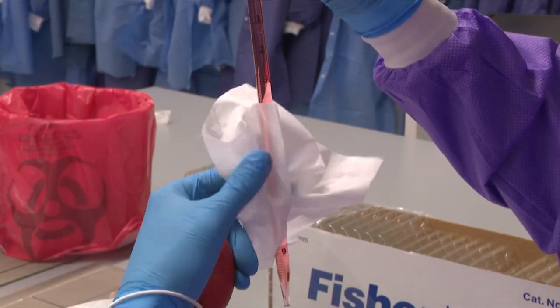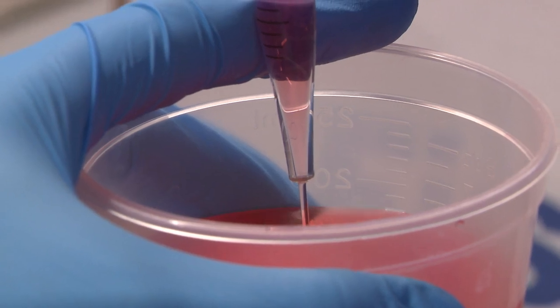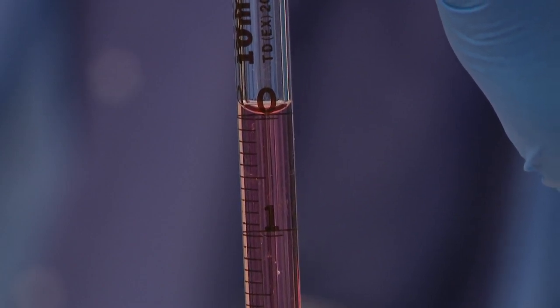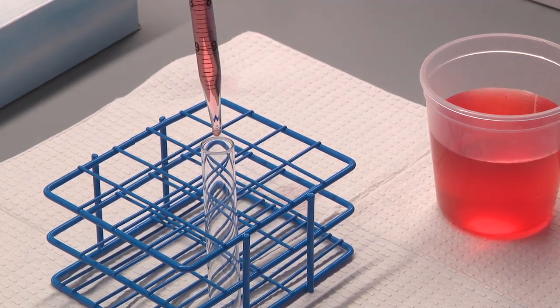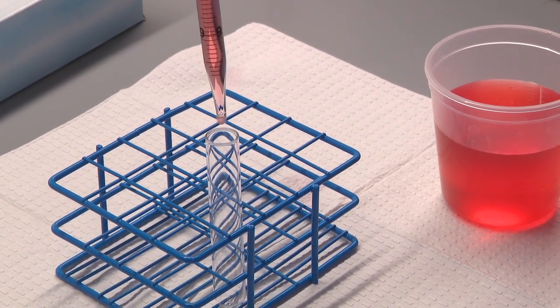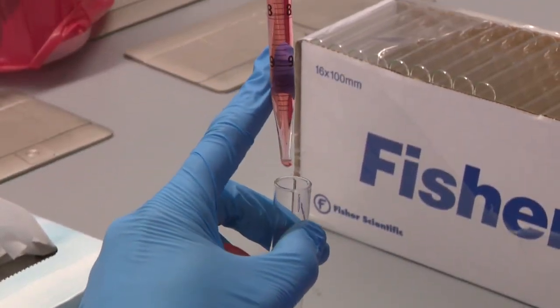Use a Kleenex to wipe the excess liquid from the outside of the pipette. Release some pressure with your index finger so that water slowly begins to drain from the pipette until the bottom curve of the meniscus reaches the 0 or calibration line. Move your pipette so it is now hovering above the test tube. Keep the tip of your pipette hovering over the test tube, making sure not to let the tip of the pipette come into contact with the test tube, and bring the meniscus to eye level.